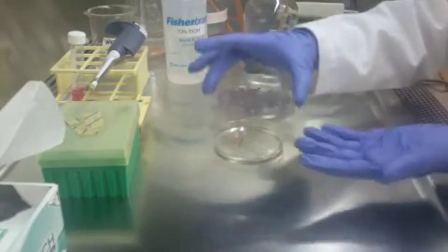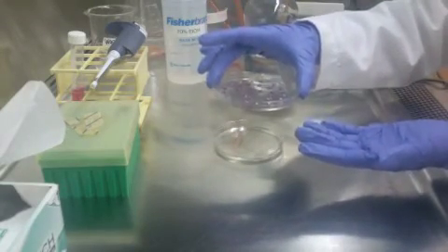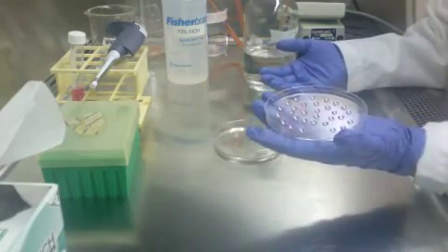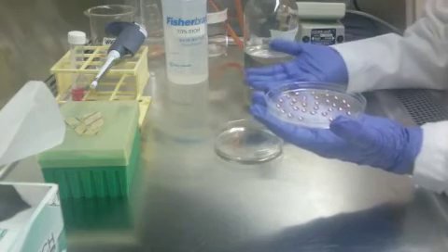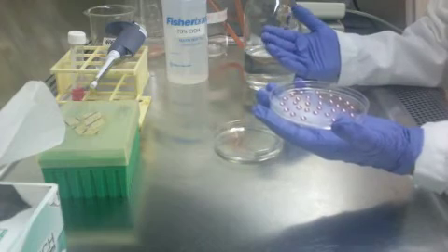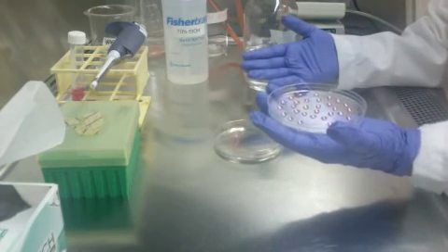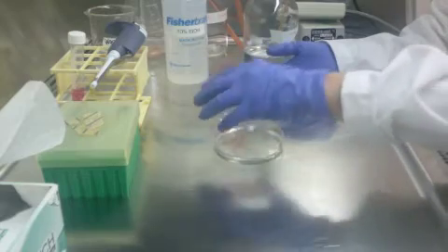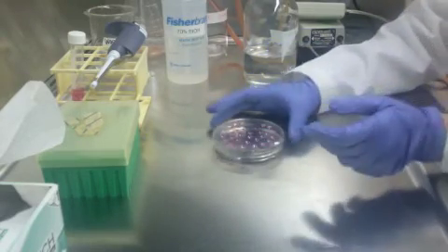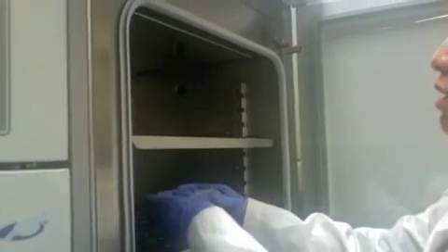Now you're ready to do the flip. Pick up your petri dish lid, place it on your left hand, and before you flip it, don't do it too fast or too slow. If you do it too fast, the drops can cascade into each other. Once flipped, you're all set — place your cells in a 37 degree Celsius incubator.